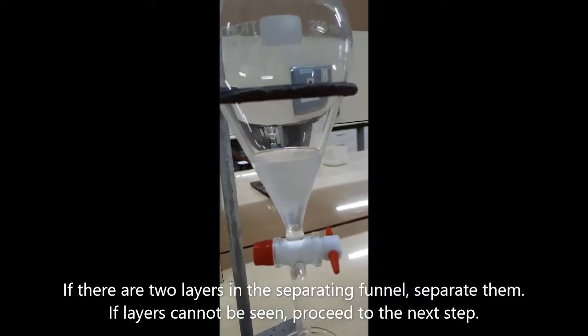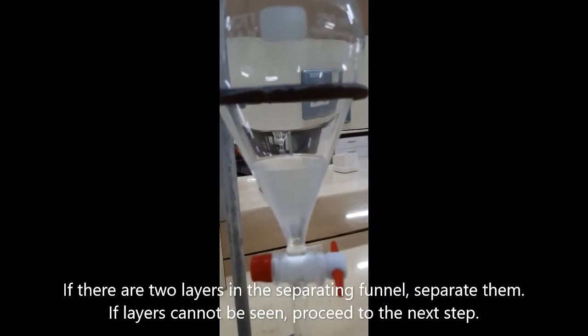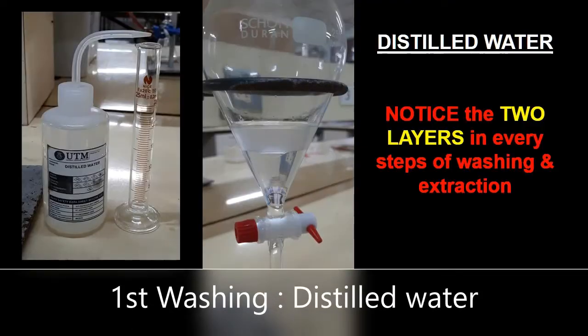Observe the formation of two layers in the separating funnel and separate them. If the layers cannot be seen, proceed to the next step. The distillate is first washed with distilled water. Observe the formation of two liquid layers in every step.